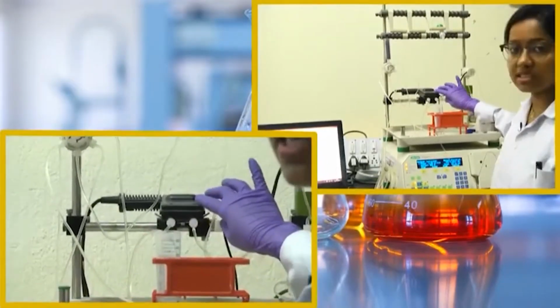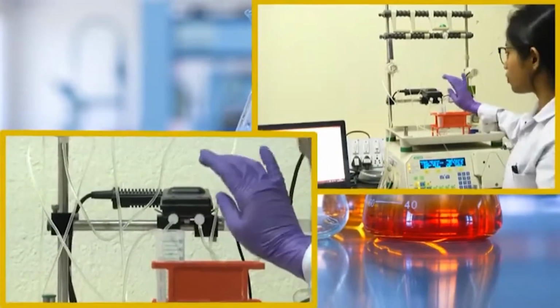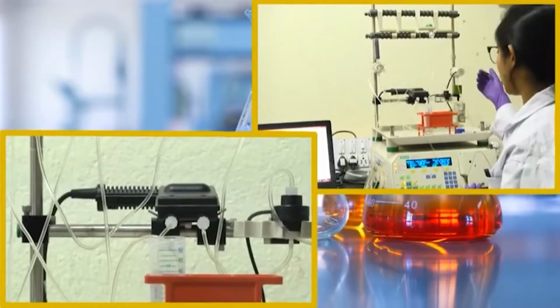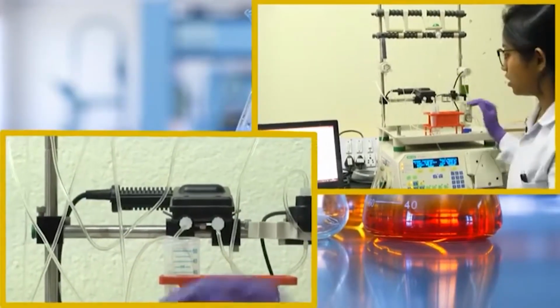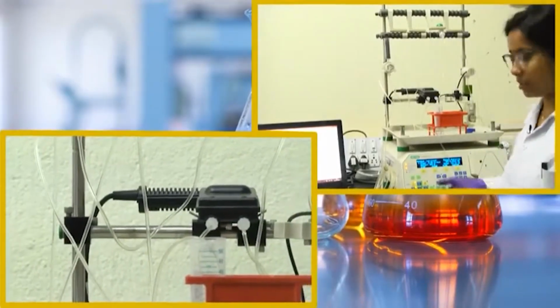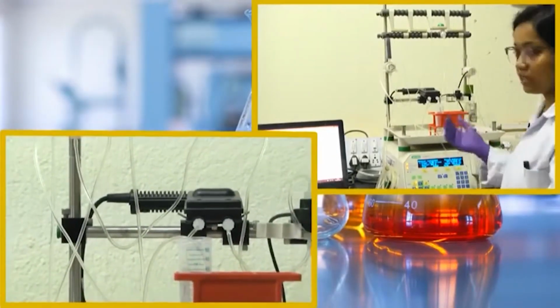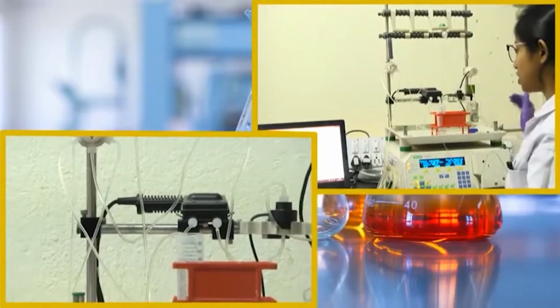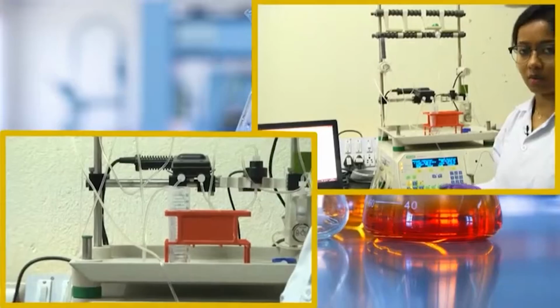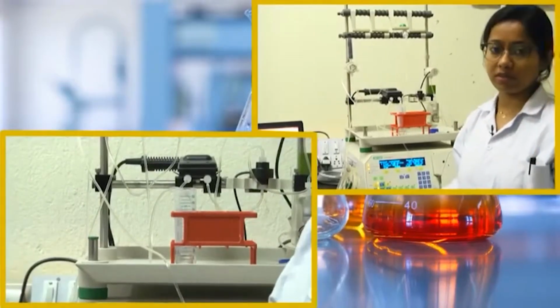So, other proteins you can see are coming out. Because our protein has a 6 histidine tag, it will get stuck to the column, and there will be a huge increase in the absorbance, and then it will again go down. When it goes down and becomes stable, then you know that you can start running a program where buffer A and buffer B will be run.